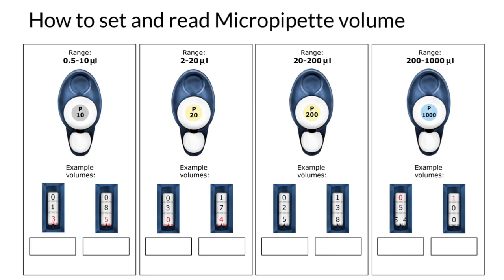So let's check what the volume set here. If you think that this is 13 microliters, it's wrong, because you see the range is between 0.5 and 10 microliters. You actually have to put a decimal point here between 1 and 3. So actually this is not going to be 13 microliters, it's going to be 1.3 microliters.